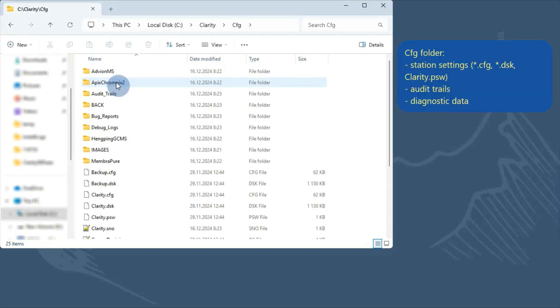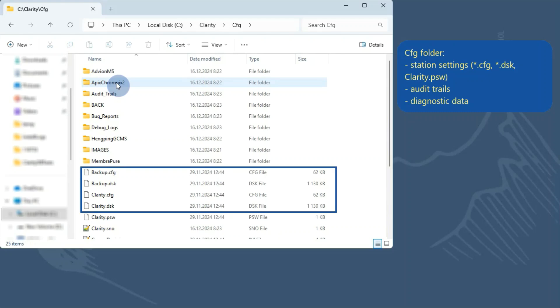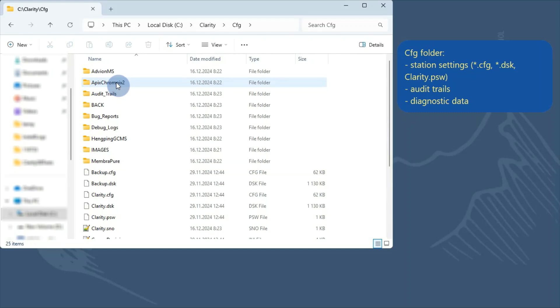In this folder, you find for example configuration files, that direct which devices you have on the instruments, and desktop files, that store user-specific settings. It also stores the audit trails and diagnostic data.